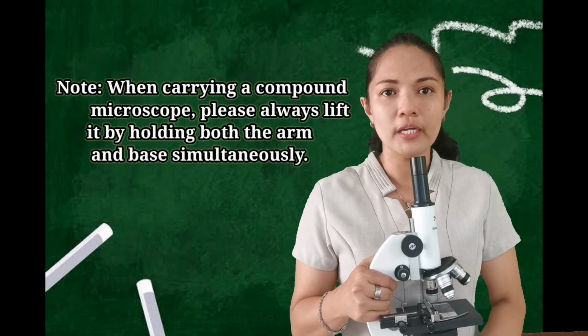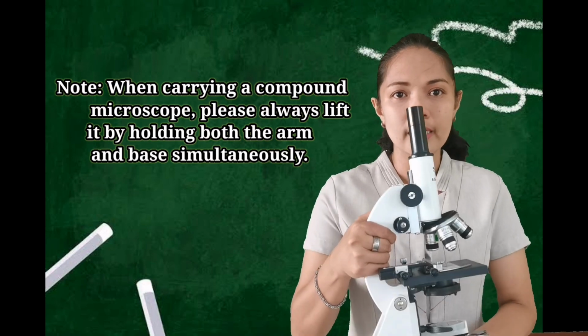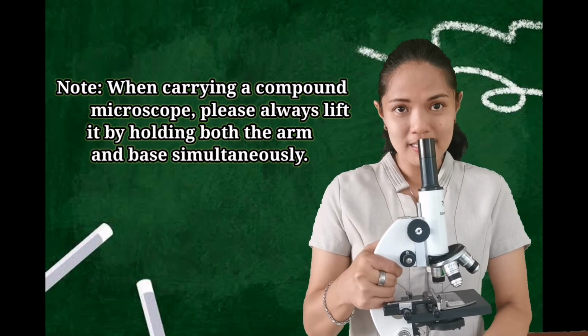Please always lift it by holding both the arm and the base simultaneously, like this.